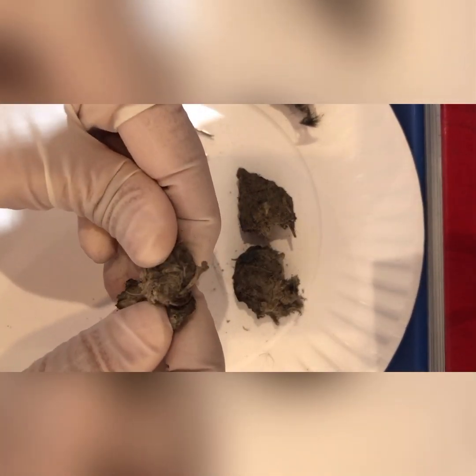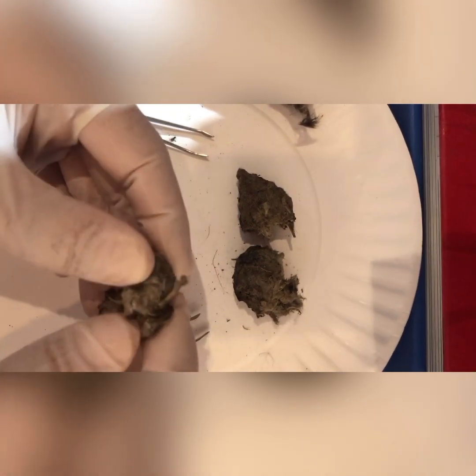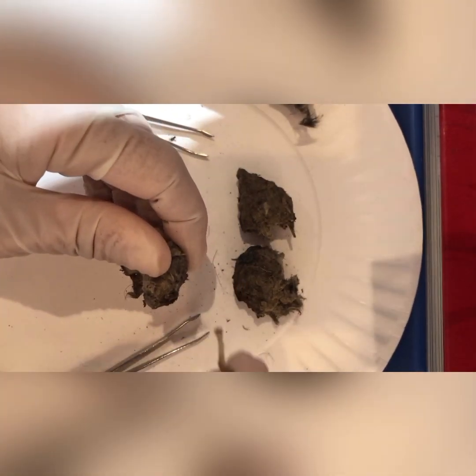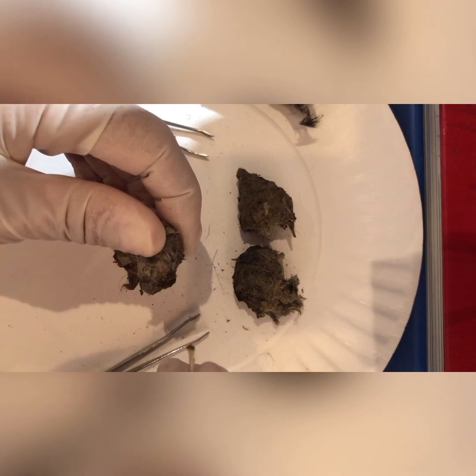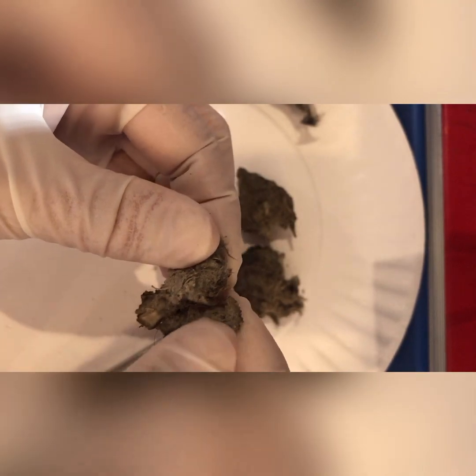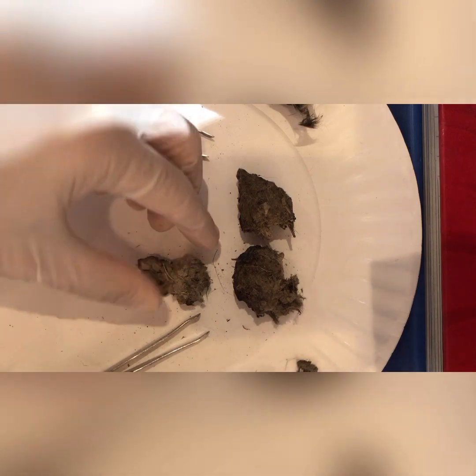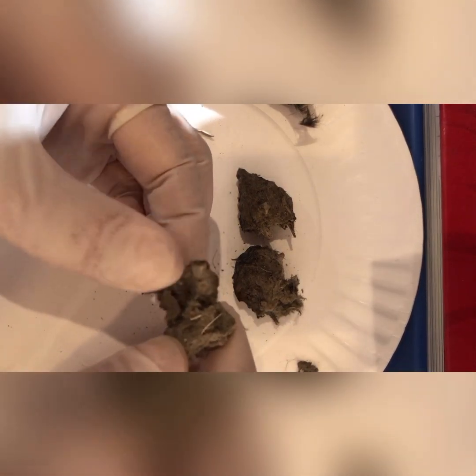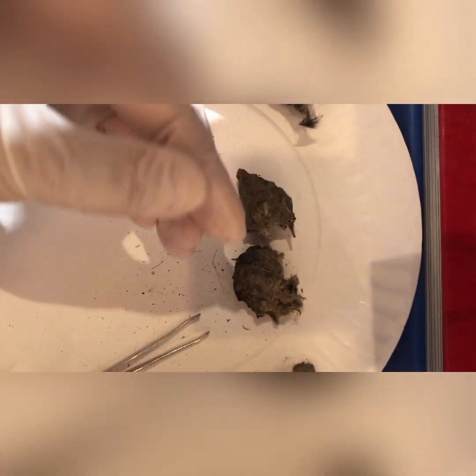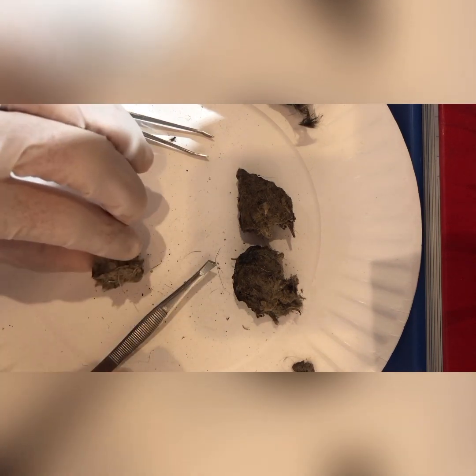And the reason we're doing this is because we want to find out what the owl was eating. What kind of food did this owl have before it regurgitated? That's going to give us some more information as to what owls like to eat, and in this region, what the owl liked to have. So I'm going to take the fur, and whatever I break up that's not a bone, I'm going to put off to the side for now. I'm still going to use my hand to break it up. I have some tweezers here, and I have a toothpick to help me break things apart.